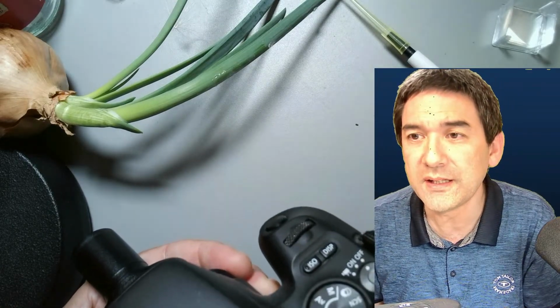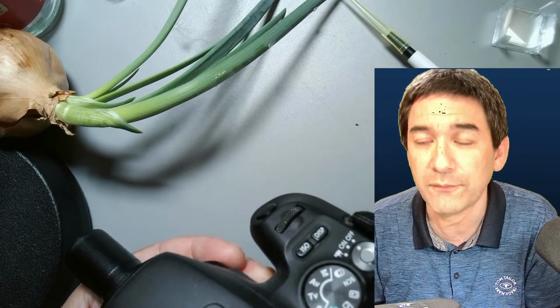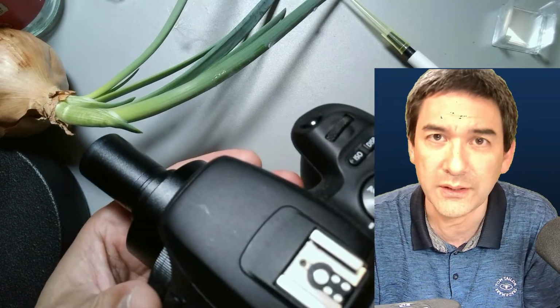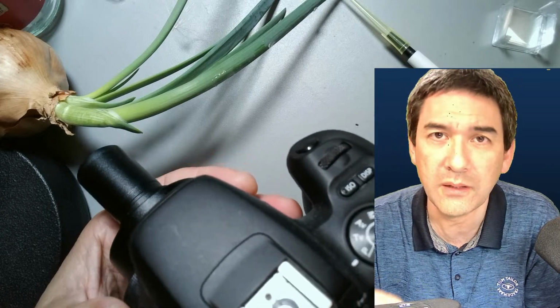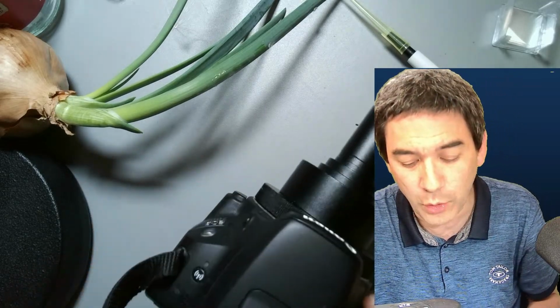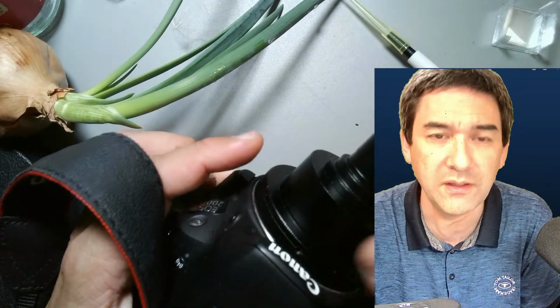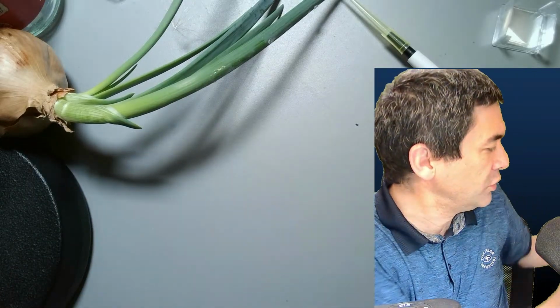So this is a little bit... If it's an Olympus, why does it say Canon? Well, the thing is the following. That's one of the questions. I've got an Olympus microscope, but a Canon camera. So the microscope is from the company Olympus, and the camera is from the company Canon. It doesn't really matter because those adapters have to fit. That's all that's important. So I just wanted to share this with you.